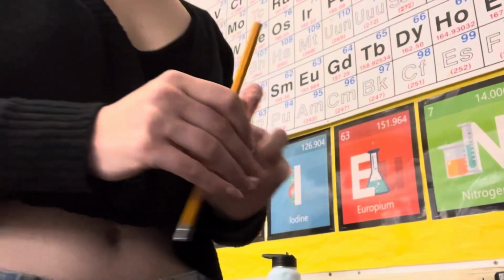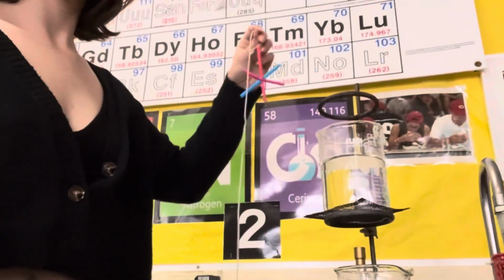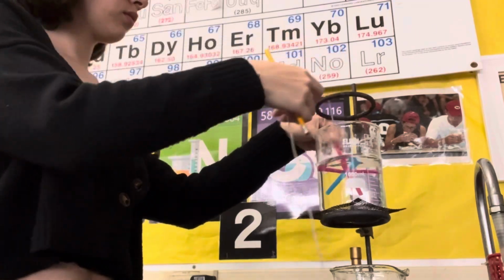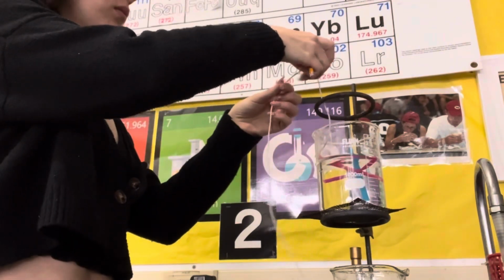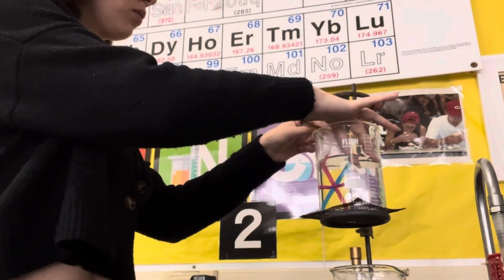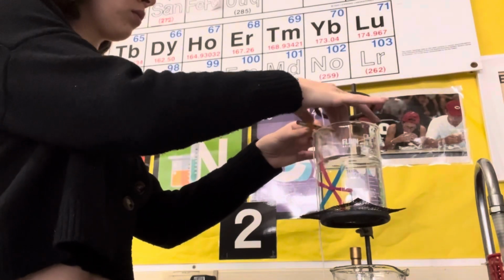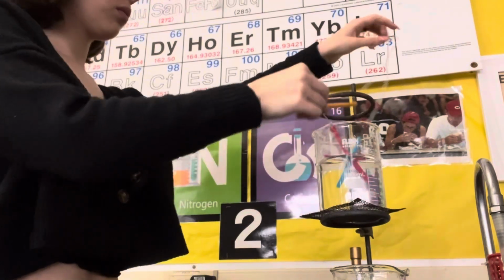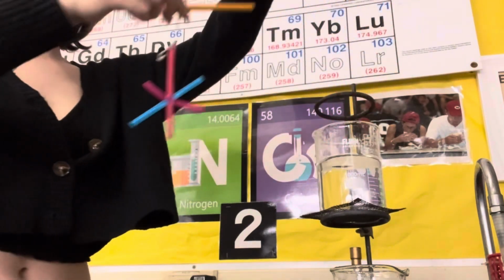Then I measured out 3 cups of water in my larger beaker, and I attached a string to the top of the snowflake. Then I measured in the water until the snowflake was fully covered, and I tied the string onto the pencil laying across the top of the beaker according to that, so that the snowflake was fully submerged in the water.